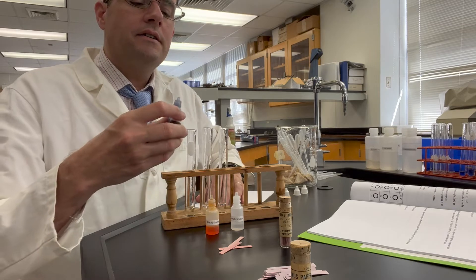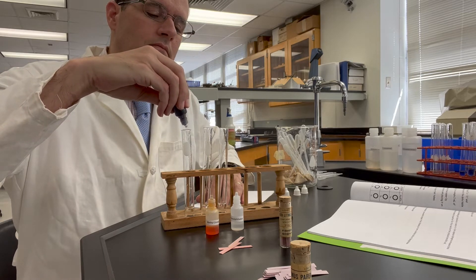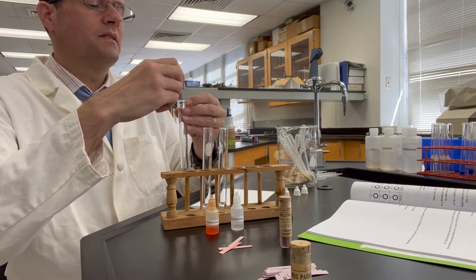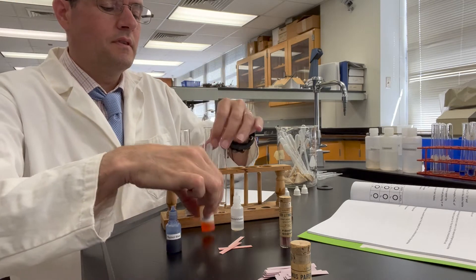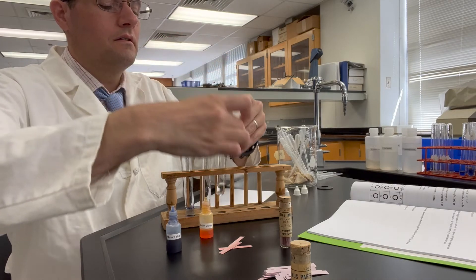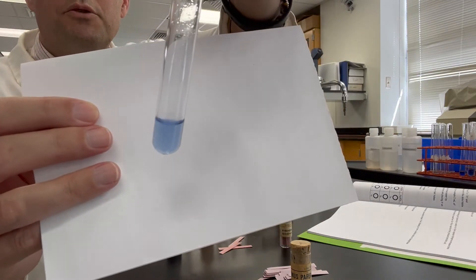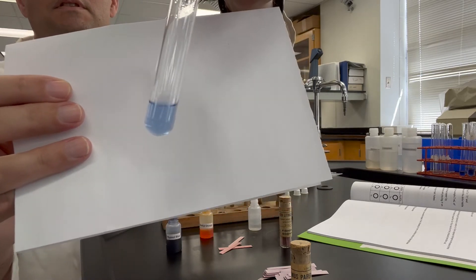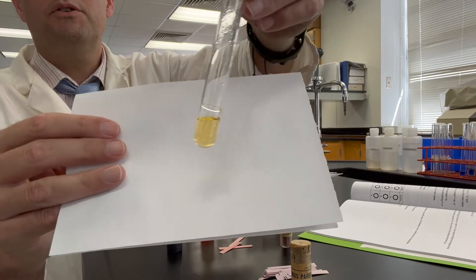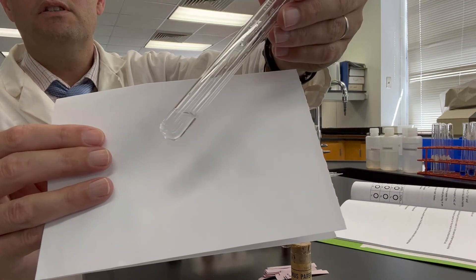Let's go ahead and add two drops of our indicators to these. This is the thymol blue in 0.1 molar sodium acetate. Here's the methyl orange in 0.1 molar sodium acetate. And here's the phenolphthalein indicator in 0.1 molar sodium acetate.